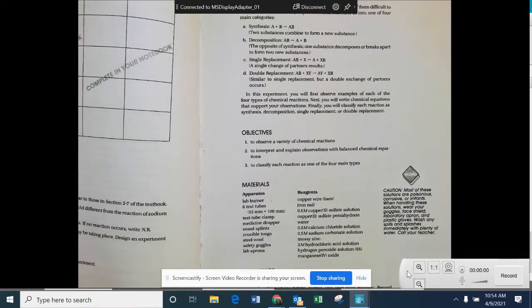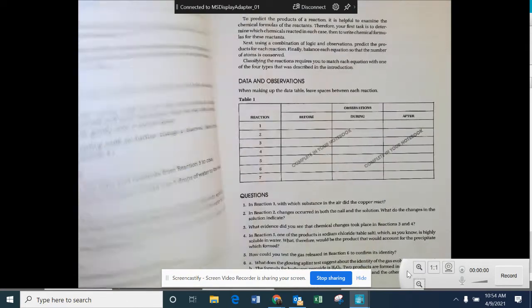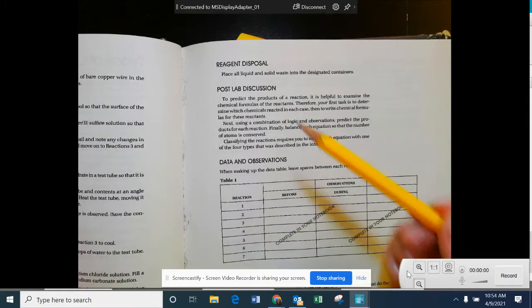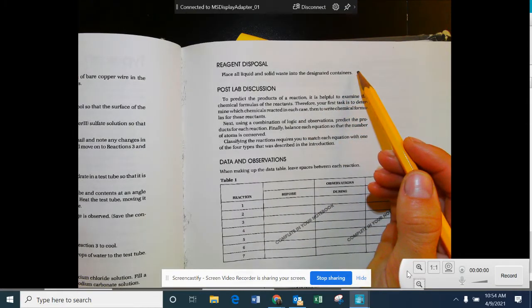And there are a couple of things we might need to filter, which is what I've done up there. So I'll have a waste beaker. If there's something with a precipitate in it, we'll do a filtration. So again, I will write that on the board, but just be aware that you cannot just dump everything down the sink. That's really important. There are some environmental hazards in this.